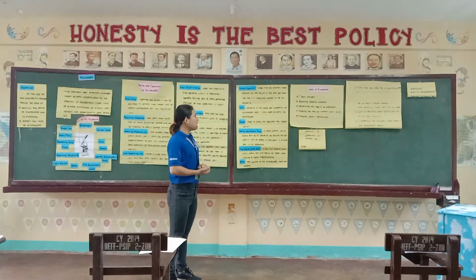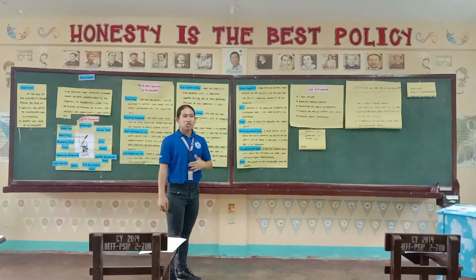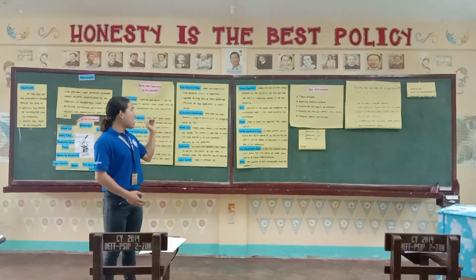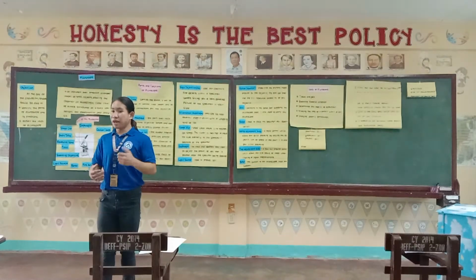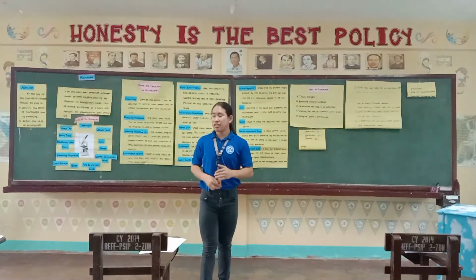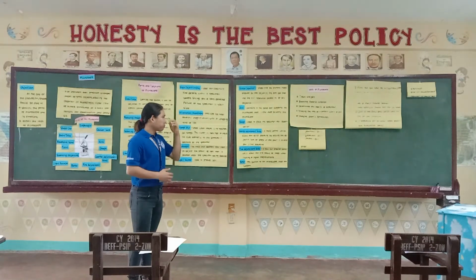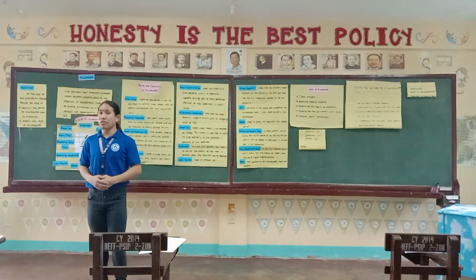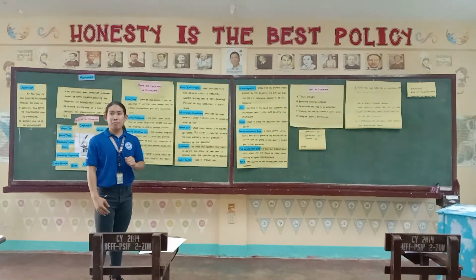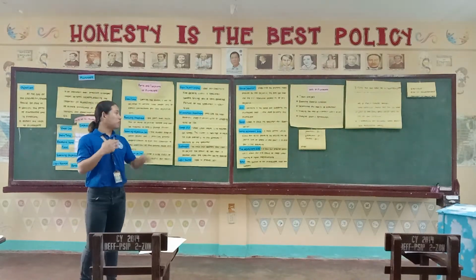So the fourth use of microscope is to study the role of a protein within a cell. As a human being, we are composed of trillions of cells. And the protein in our body is very important for us to be able to work every day. The main function of protein is to supply energy to our body. To examine whether our protein functions well or not, we have to use the microscope to clearly see the entire structure of the protein.